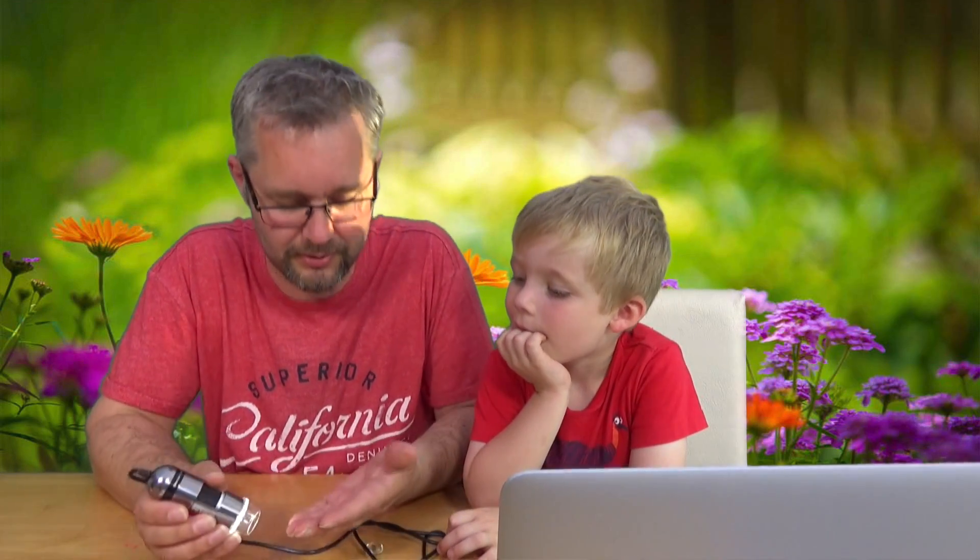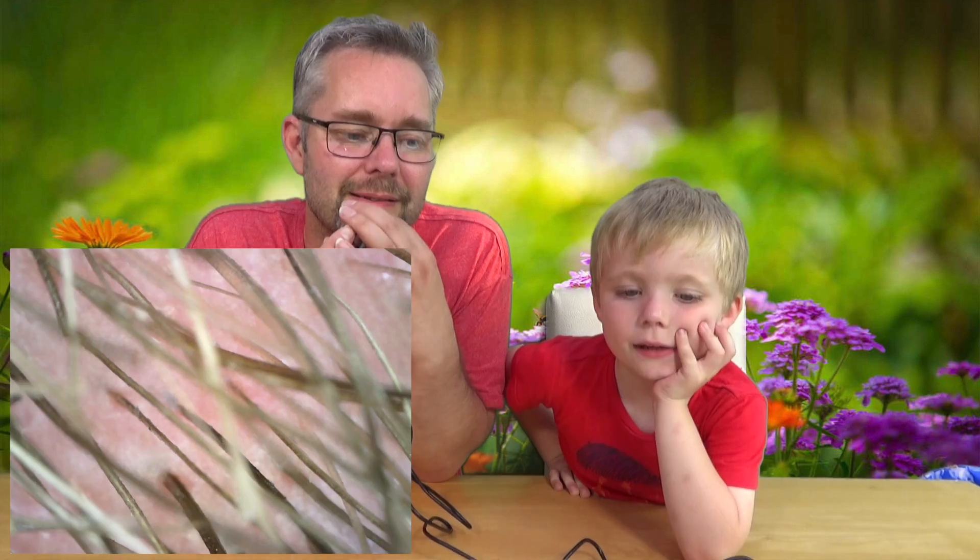Should we do some body parts? Let's have a look at some skin. Let's have a look at a fingernail or nail. Skin's usually really horrible because it's not how you remember seeing it. Let's have a look at the knuckle. And watch — have a look at my beard. Look at this — this is horrible. Can you see the hairs coming out of my chin? You can see the hairs actually coming out. This is disgusting — look at that, my knee's disgusting.